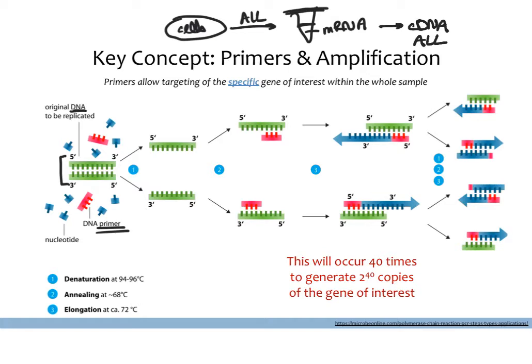And so you really need to tell your experiment what you're interested in looking at. Like, which gene do I actually care about? You're not measuring all of them in this experiment. You're only measuring one or two or maybe five that you're interested in. And so that is the role of the primer. The primer targets and isolates specifically the gene that you are interested in because only that gene can be amplified. If there are no primers, then that gene cannot be amplified. So the primer is what allows amplification of the specific gene that we're interested in. And because it gets amplified with these specially tagged nucleotides, the machine can read out how much amplification is happening.